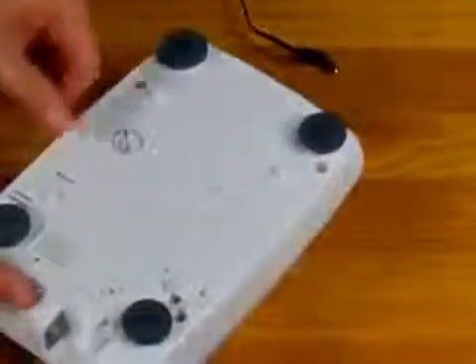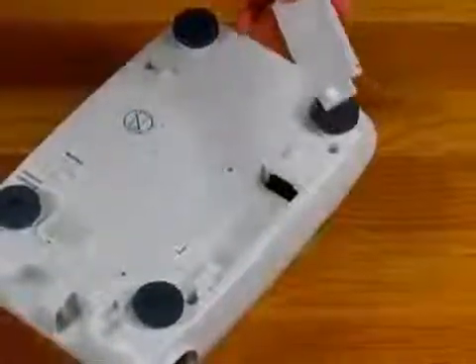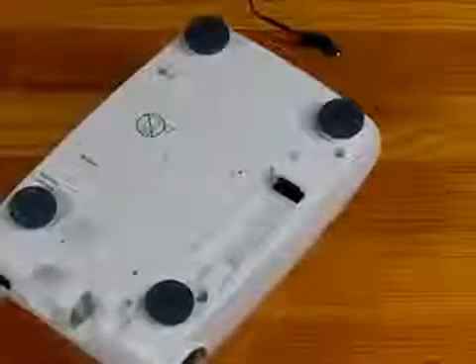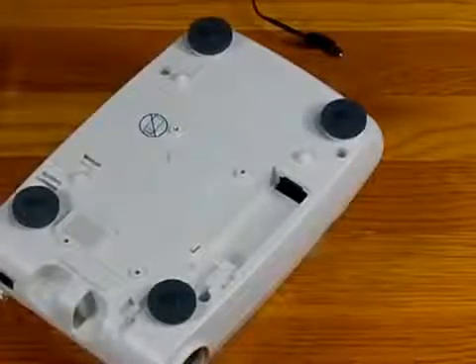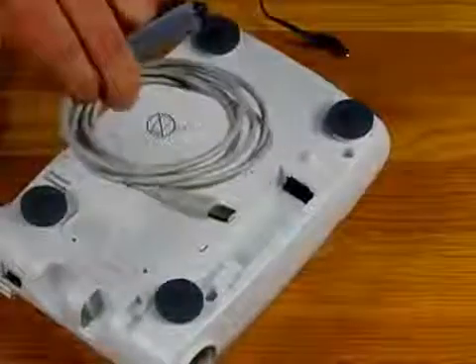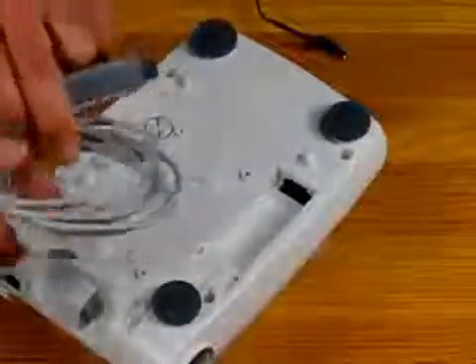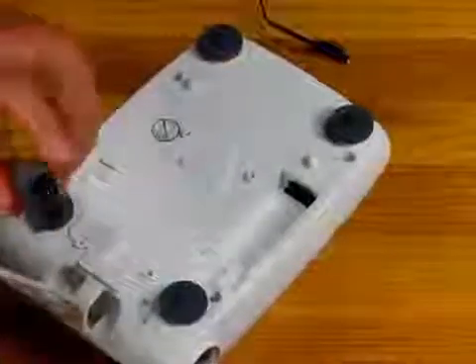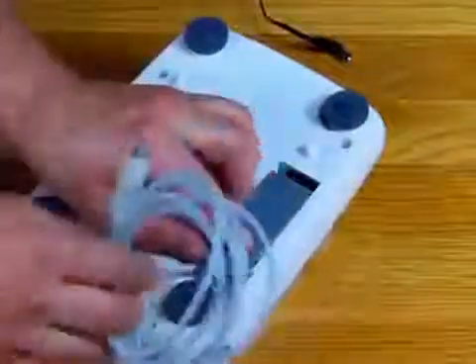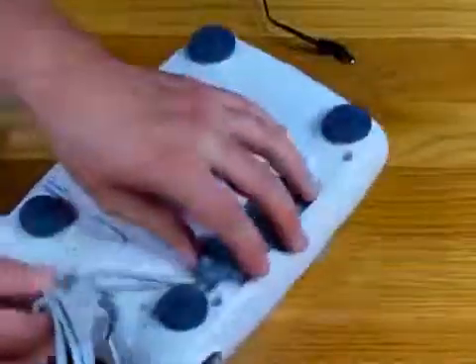Another feature I wanted to show you is an accessory you can purchase for this balance. This little port comes off. You can purchase either an RS-232 interface or a USB interface. The USB interface is probably the most popular, because you can't buy a PC nowadays standard with a serial port. This is the USB, and you'll see you have just a little connector here, and basically one slides the module right into the balance, and now you would have communication with your computer. So this just puts in like so.